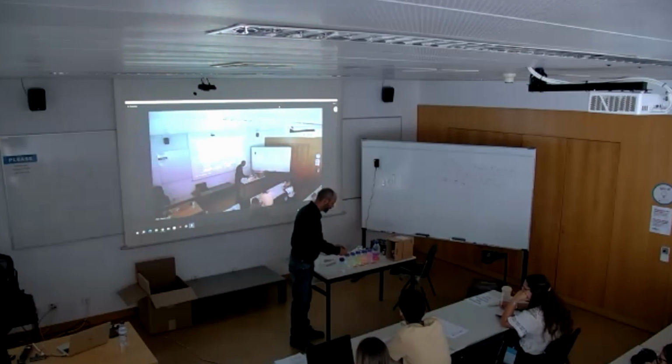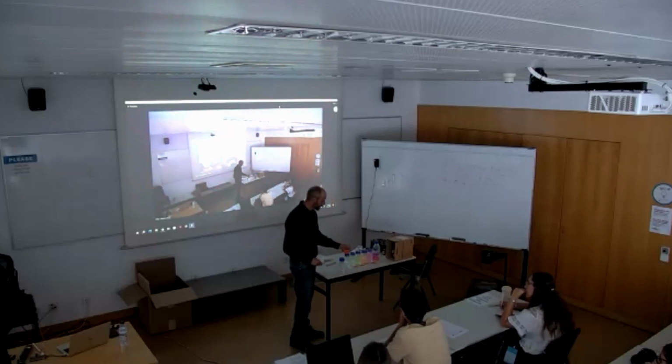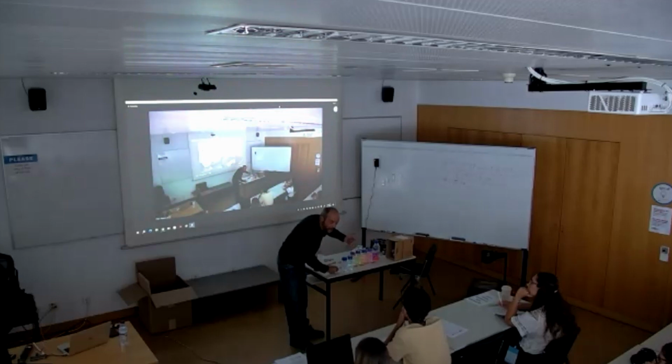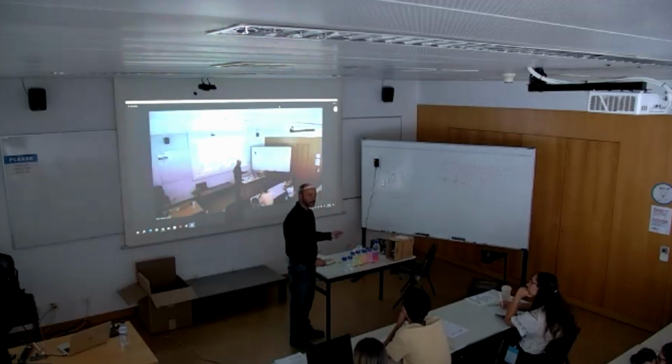Now, I will use a substance that is actually tonic water, and it has fluorescent properties, and it's excitable with a near UV light, so 405 light. I will show you the difference between water and this substance that looks like water. And here, do you see the light? What you are seeing there is not the laser, because the laser is invisible. In fact, we don't see anything there. So we are hitting this substance with invisible light, and then we are seeing visible light. So the substance is changing the nature of light, because the substance is absorbing energy and giving back energy, but at a lower level that actually falls in our visible spectrum.